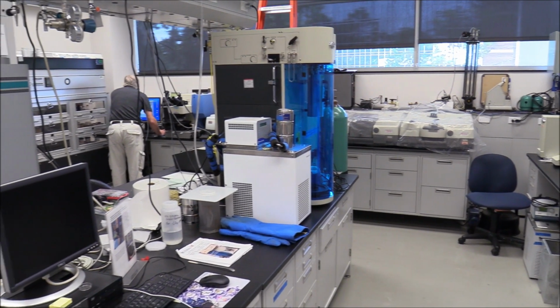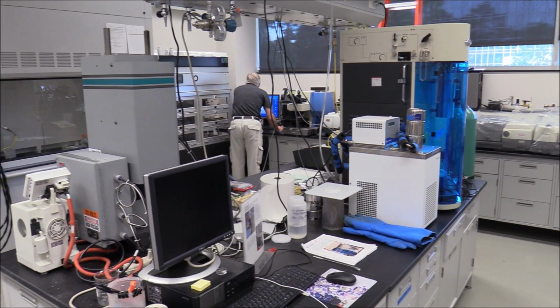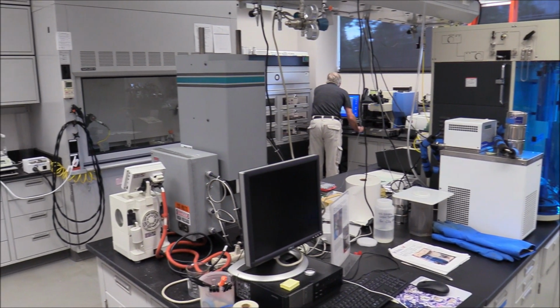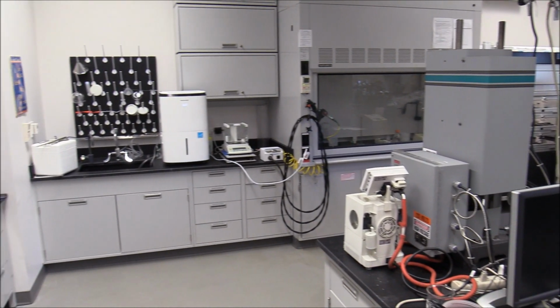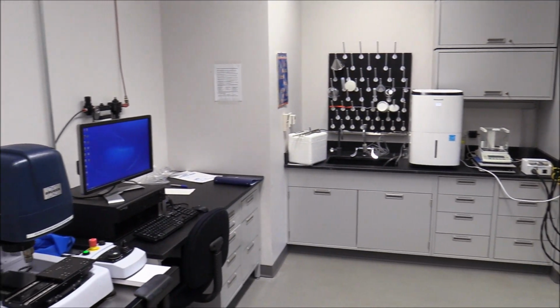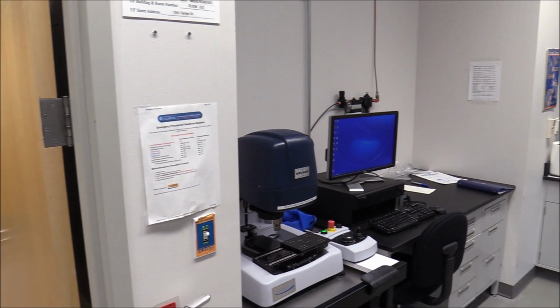Behind the AutoSorb, we can see the Fourier Transform Infrared Spectroscope and Microscope, or FTIR for short. It can be used to identify surface and bulk compositions of many materials, including gases, liquids, solids, fibers, and thin films. On the left, the Contour GT-I is a versatile benchtop optical surface profiling system that can measure surface topography from 2D and 3D with high accuracy in a range from fractions of a nanometer up to approximately 10 millimeters.